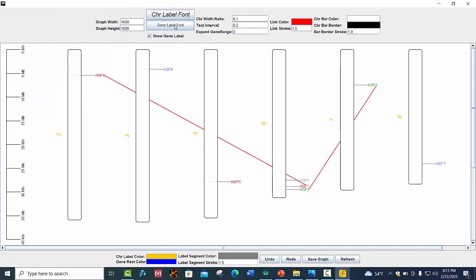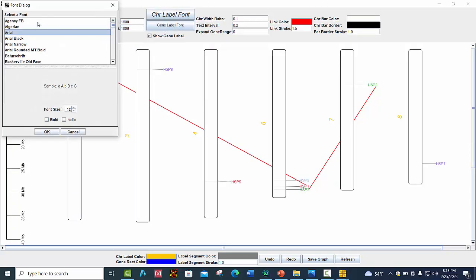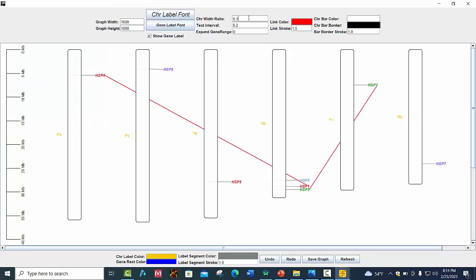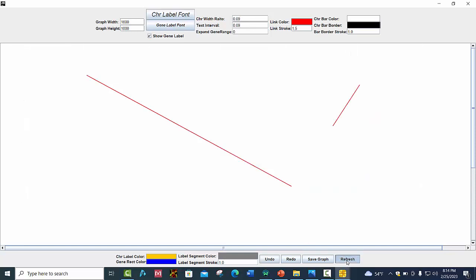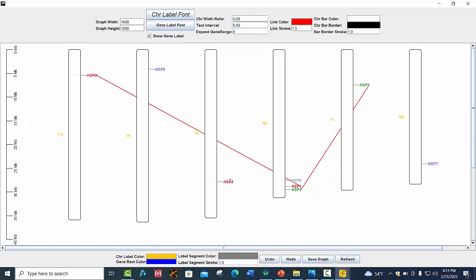Similarly, you can also change the gene label font — you can choose bold and italic. You can also change the chromosome width ratio, like 0.09, and press the Refresh button to see the chromosome width change.